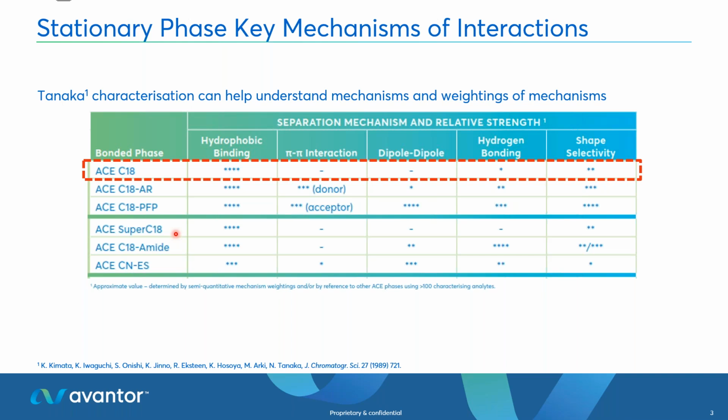We haven't really done much polymer analysis on silica-based columns. Most of the polymers we've analysed have been on polymeric columns because things tend to get a bit sticky on silica. But it will depend heavily on what the polymer is, how big it is, etc. So I think we should probably go back on that one and maybe start from the applications database and go from there.